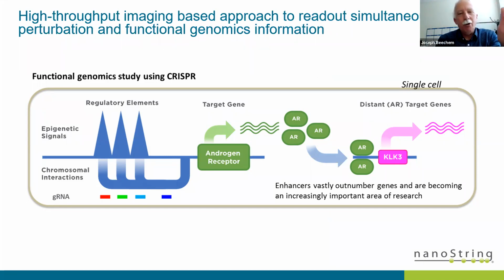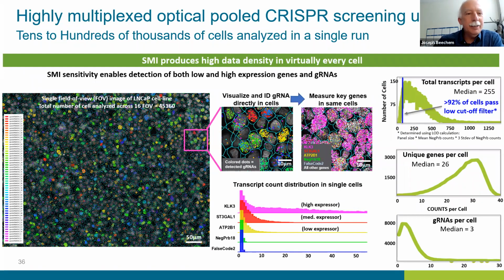So the cells you saw up there were called LNCaP cells, and he's knocking down various regulatory elements of the androgen receptor, really a key receptor for prostate cancer and a number of other things. And then we're looking at the downstream effects of that in our functional assay. And then you can literally take assays like that and read them off almost like a cartoon. That's more on the next slide.